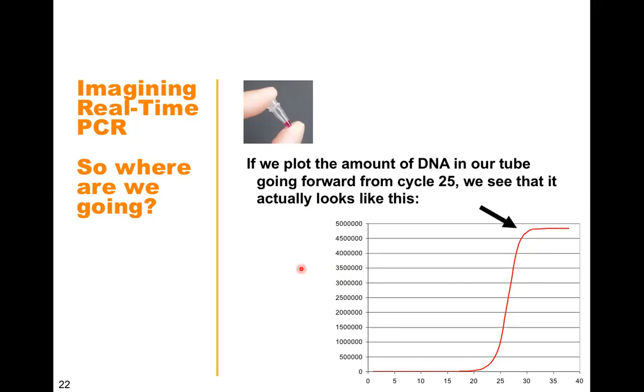Let me give you an example. The range is 10 lakh over here. That is the standard or threshold range we put for the reaction. Say you have the cut margin sample, the second sample is a tumor sample, and the third sample is the treatment sample, any kind of treatment.